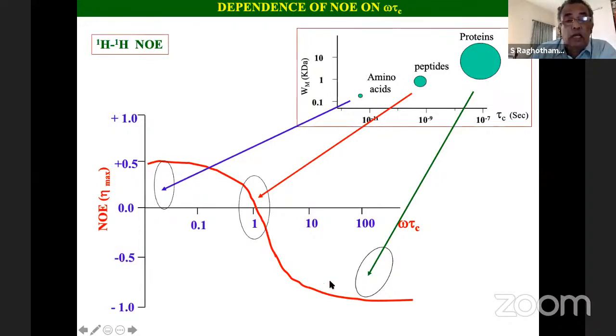Now, this is again another very useful, important experiment. Now we have got the residue-specific assignments from the COSY spectrum. Now you can get the sequence-specific assignment because it can pull up connectivities from the first residue, the second residue, the third residue, and all. So it can also pull up distance connectivities. If the protein folds and residues come nearby, as I said, from the first residue to the 100th residue, it can pick up that connectivity also. So the more connectivities it picks up, the better the quality of the spectrum.